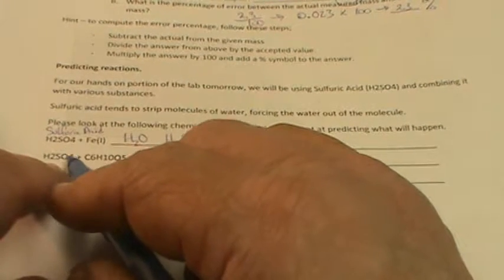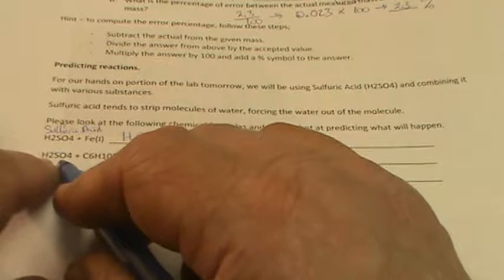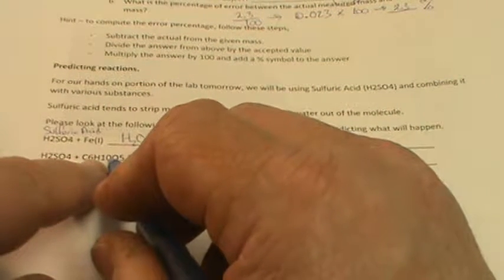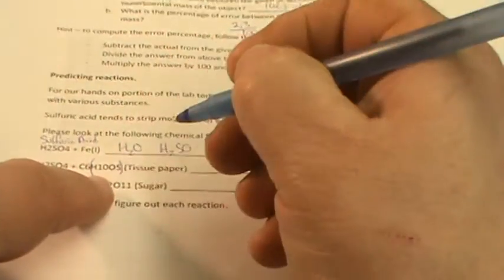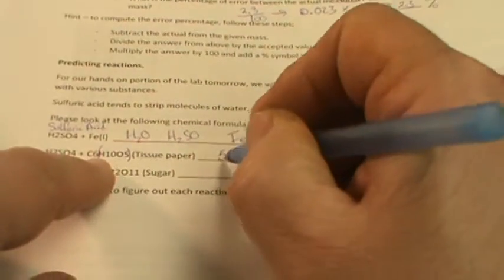Sulfuric acid wants to release the water. The hydrogens and the sulfurs in here are not going to bond to the carbon, but they're going to have a violent reaction with the water, and we're going to drive the water off. So, in tissue paper we have H10O5. That means we're going to have 5 H2Os. 5 goes into H10 5 times, that leaves H2, and it goes into 5 oxygens, one time, so it's 5 oxygens.